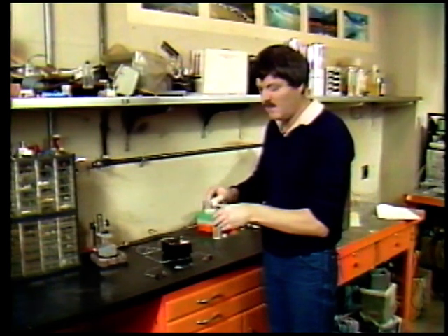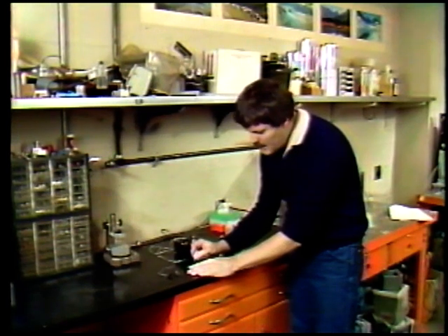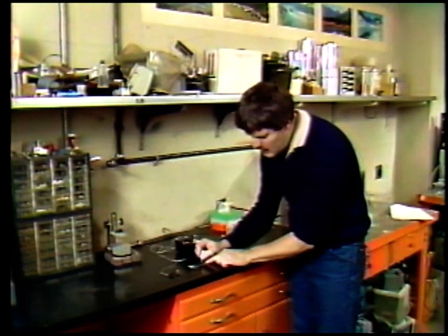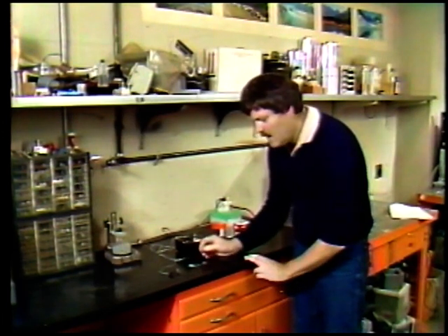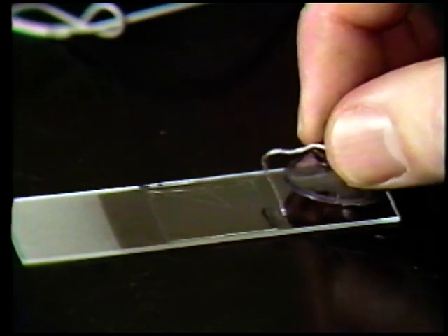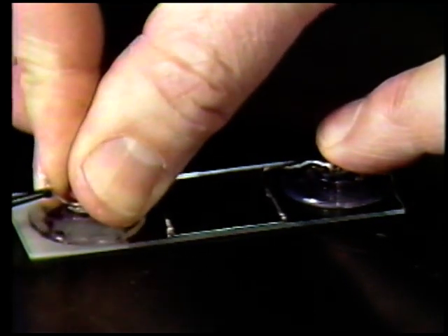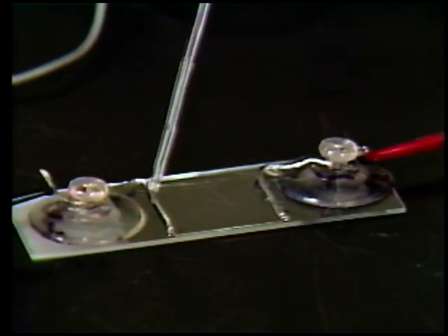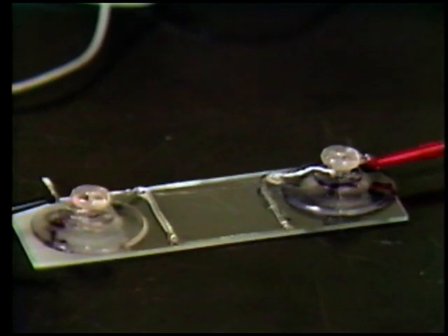Now, 5 minutes after the agarose has gelled, or has cooled for 5 minutes, I apply a strip of fingernail polish to two sides of the microscope slide. And these are my electrophoresis electrodes. They consist of platinum wires attached to little suction cups, which I attach to the slide so that the wires are next to the cover slip. This is electrophoresis buffer, and a drop on each wire connects the electrodes to the edges of the cover slip.